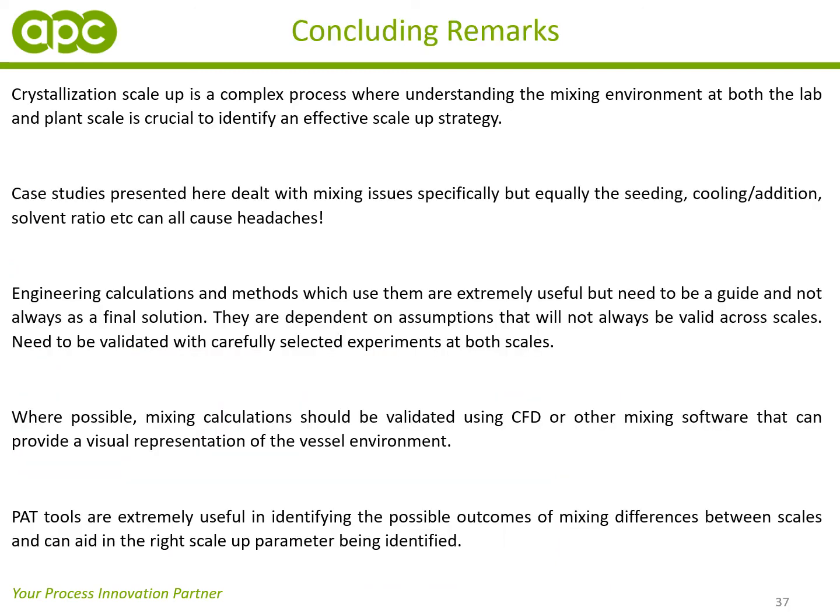So just some concluding remarks. As you can see from the two case studies presented, crystallization scale-up is a fairly complex process. What was looked at today were two examples where mixing was the dominating factor for scale-up, but equally, things like seeding or how you seed, your cooling and addition profiles, solvent ratio, etc., can all be troublesome and typically have to be examined.